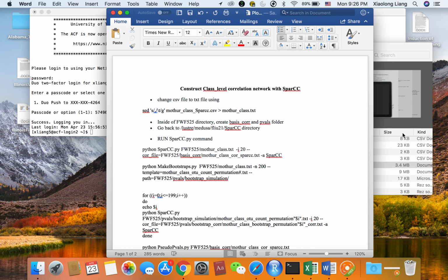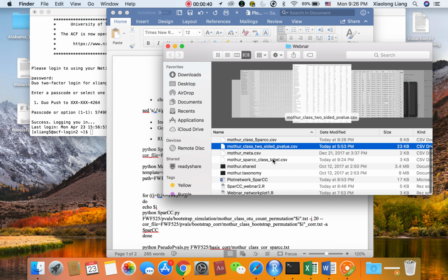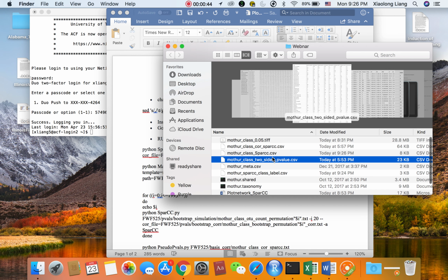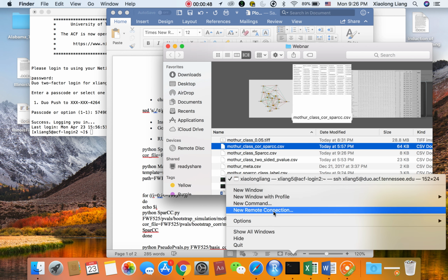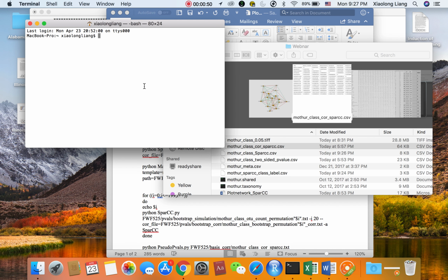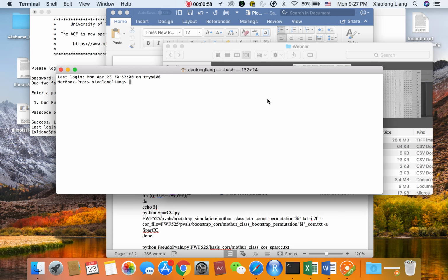Let's see. Here it is. So we need to transfer this file to ACF and analyze the data on ACF using SparCC.